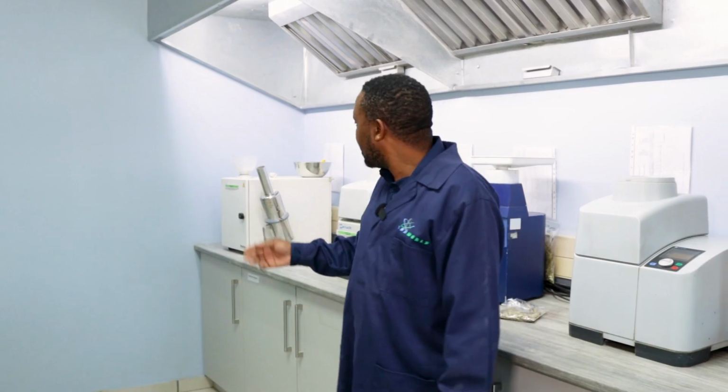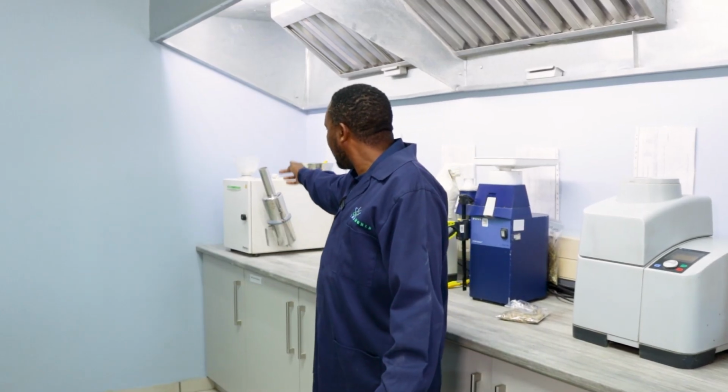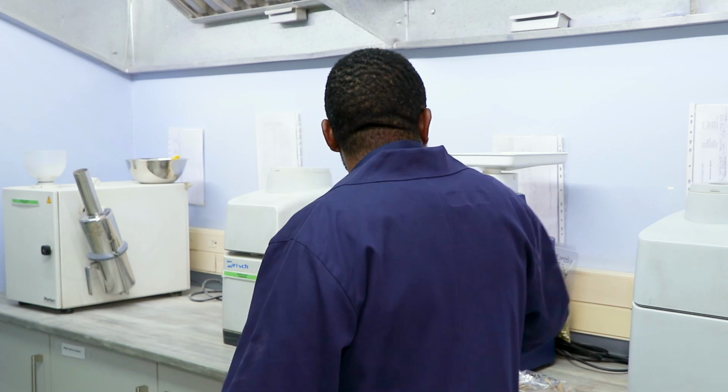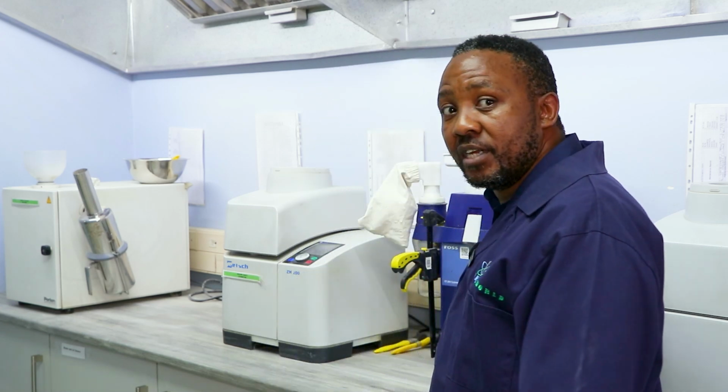This is our milling department, where we have different types of milling equipment. This one is our hammer mill, where we mill our inorganic samples. And this one is our Retsch machine, where we mill our animal feed samples. And this one is our Foss machine, where we mill our silage samples.